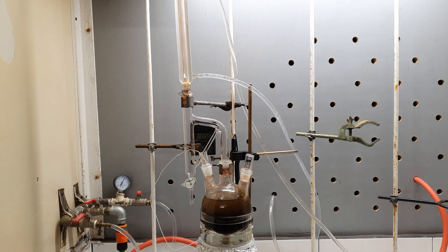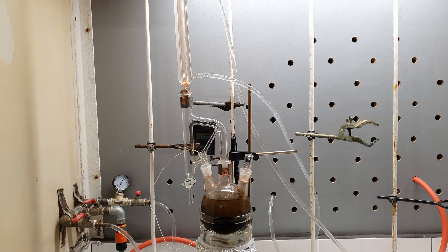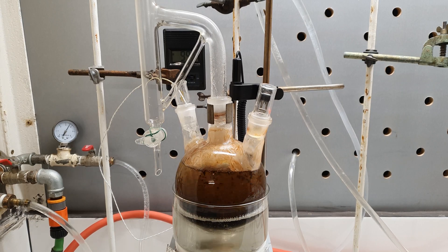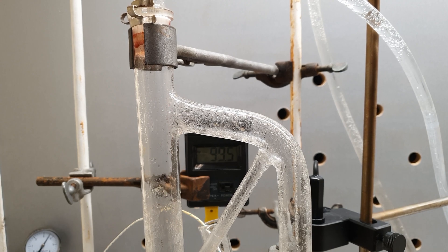The most effective way to get the iodobenzene out of this mixture is to steam distill it. Iodobenzene is very volatile with steam and can be distilled very quickly that way. And since it doesn't mix with water, I decided to cheat a bit by using a Clevenger apparatus.